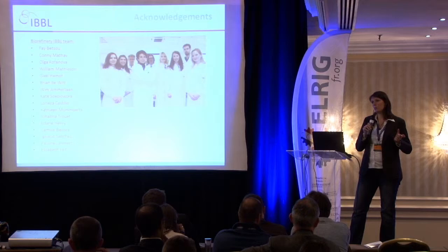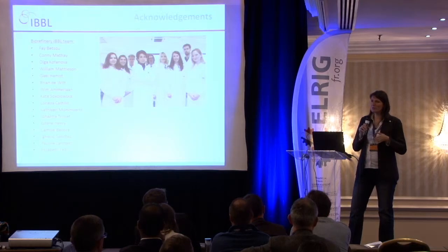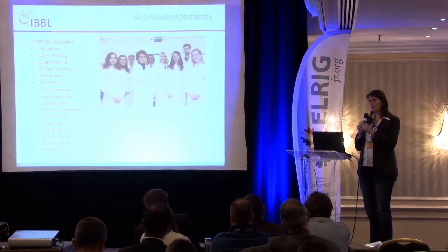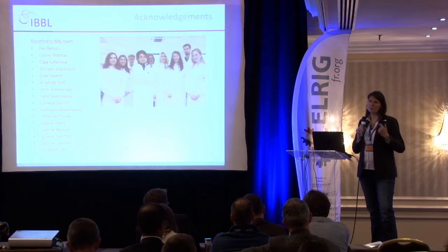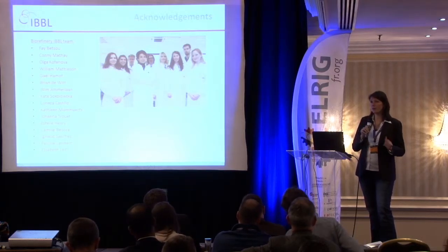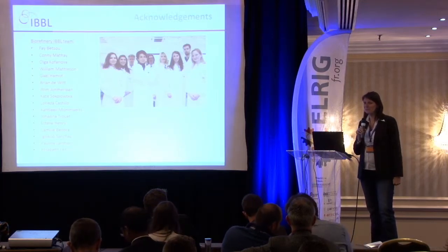What's also possible is that we do aliquots later on, because there might be samples which are really precious, and where we then decide, okay, now we do aliquoting. I should also add that we do 1 aliquot for our routine sample collection, but if there is a special project where the PI defines in the beginning, I need to have 5 aliquots, we will do it, although it's maybe not our standard process, but it depends on the project.